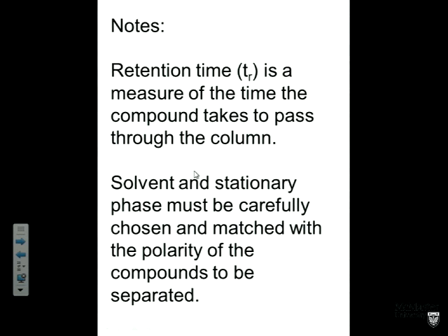So as the molecules come through, they absorb UV light. But that is a topic to be dealt with in 2OB3. Or you could have a mass spectrometer hooked up to the column, analyzing the molecular weight of the compounds that are coming off. And that's a topic that we will look at next week. So just an imaginary detector that somehow detects molecules coming off.